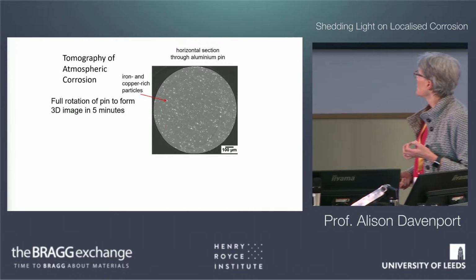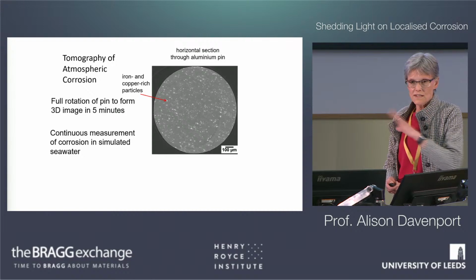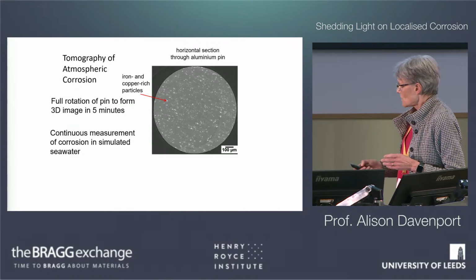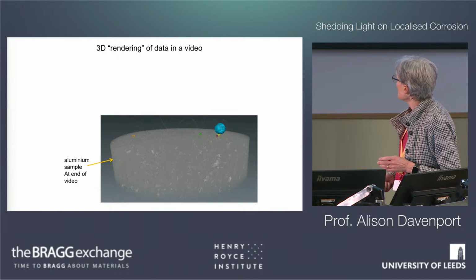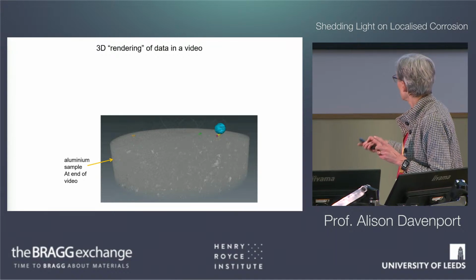So each rotation took 5 minutes. So what we did was continuous rotation of this pin, continuously measuring it and watching pits develop on the top surface. So what I'm going to do now is to show you a video of that process, and I'm going to show you a video where we rotate.